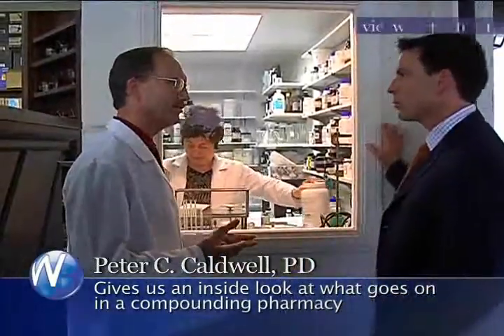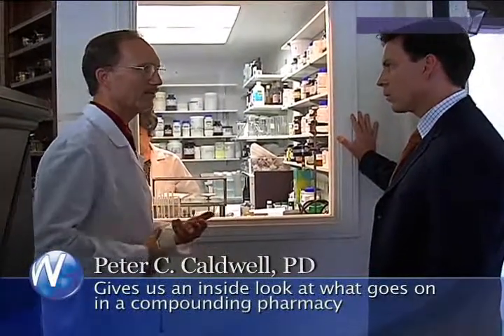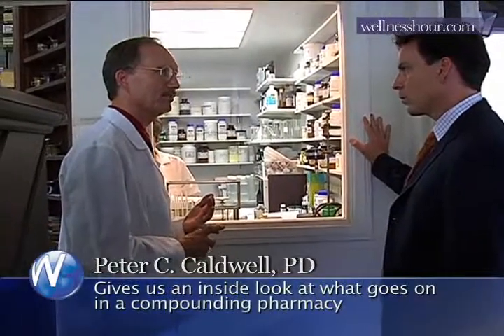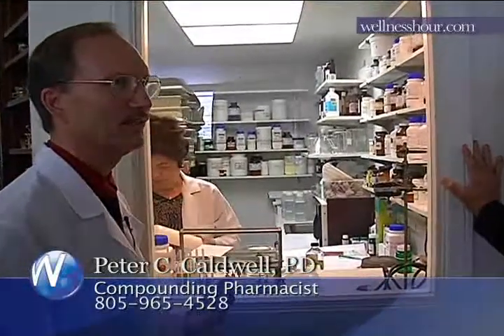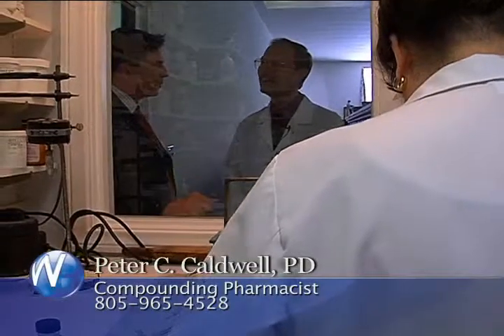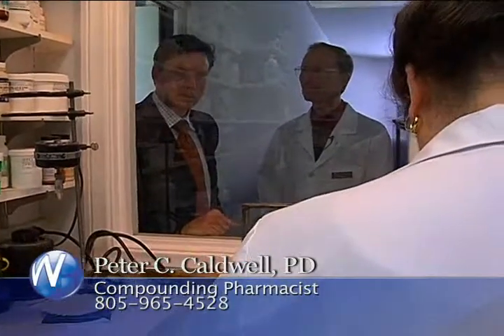You know, we also make creams that you rub onto the body, either the forearm or the neck or the lower abdomen, and those have to be specifically prepared also in a particular base that enhances the absorption of the hormone or whatever the product is that we're using. So what is she doing right now? She's filling the capsules with the peanut oil and progesterone mixture.